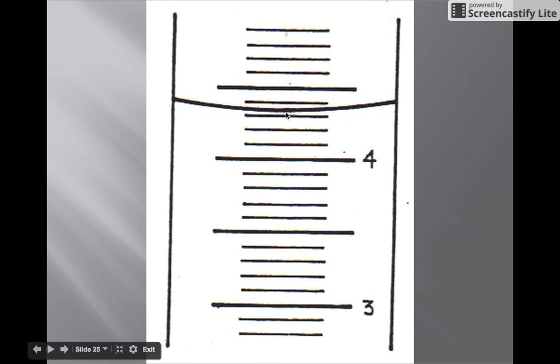And it doesn't look like it's halfway, so it's a little less than halfway. So I'm going to think this is 4.34. So the official volume here is 4.34. We could argue about 4.33. So either of those would be correct.